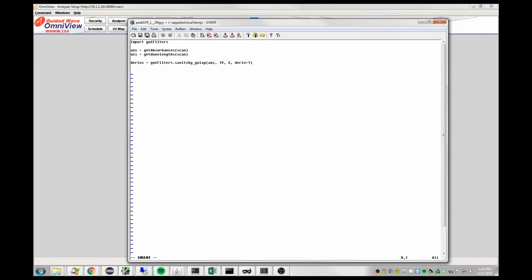So that's why the function I'm about to call uses derivatives. So I'm going to assign a variable here. I'm going to look for a peak near 1144. I don't know exactly where it is, so that's what this function is going to do, find that peak exactly for me.